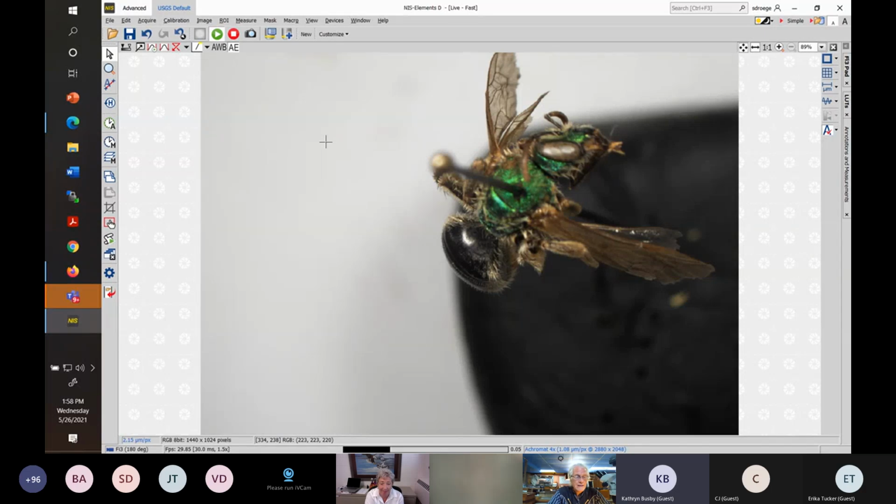Yeah, so in that case, if you had a male, then you wouldn't use that character, right? That's the thing about these matrix guides to wrap your head around: I'm going through things very sequentially, which is a dichotomous mindset. But normally you don't. You jump around, and everyone at some point starts skipping, like, I don't like that, or I know that's not useful.